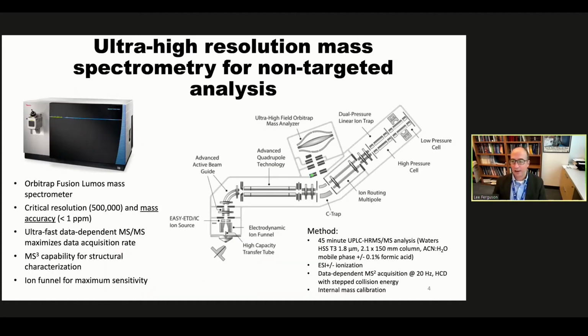So it goes without saying, in our laboratory and in most of the laboratories that do this work around the world, ultra high resolution mass spectrometry is really the enabling technology for this kind of work. I'm not going to dwell on this, but I do want to note recent advances in the last 5 years, which have increased resolution to close to 500,000 in some cases, and most importantly, mass accuracy, such that we can define masses of contaminants that we're finding in the environment down to less than a part per million.